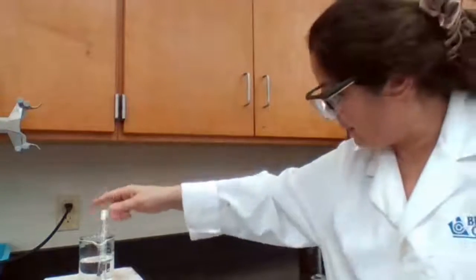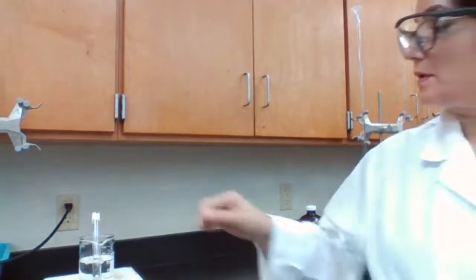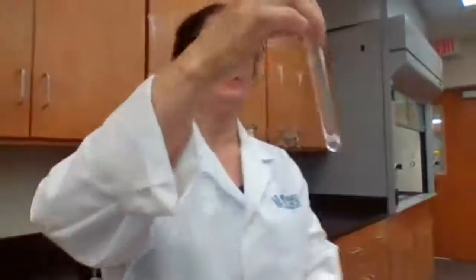So it's a clear and colorless solution, so nothing happened to it. Going to take it, cool it down, and place it in the ice bath.